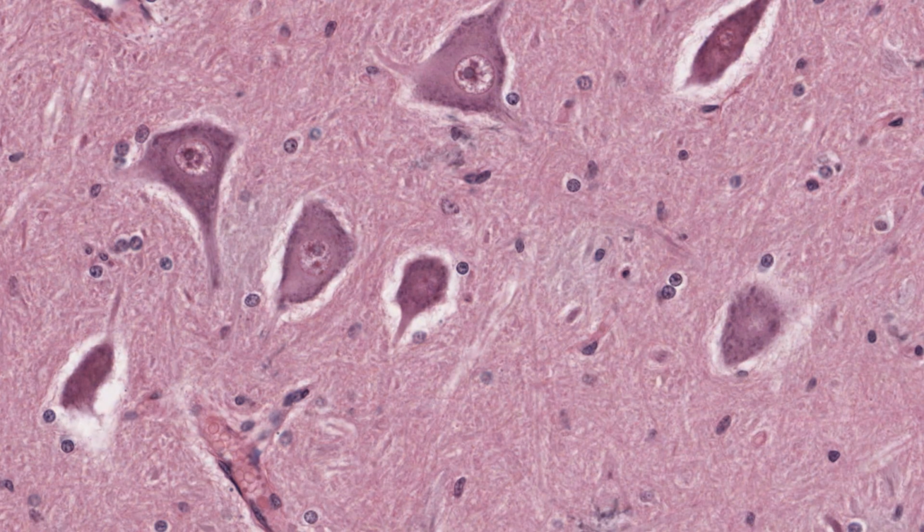The granular endoplasmic reticulum in these large motor neurons and also ribosomes contain ionized phosphate groups on the ribosomal RNAs. They also exhibit basophilia, so they're going to stain a bluish-purple colour with the basic dye of hematoxylin. And so the cytoplasm often has this bluish tinge, or is more apparent in these neurons as bluish masses.